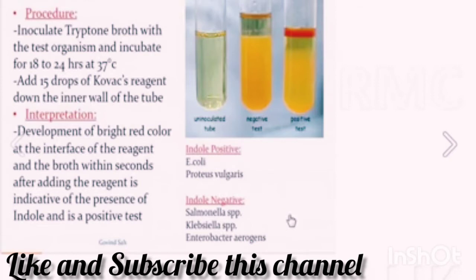Those members of the Enterobacteriaceae family that are indole positive include E. coli and Proteus vulgaris. And those that are indole negative include Salmonella species, Klebsiella species and Enterobacter aerogenes.